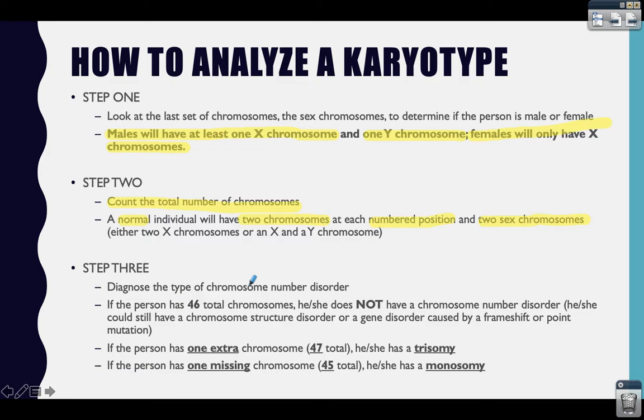The third step is to diagnose whether the person has a chromosome number disorder or not. We are not doing chromosome structure disorders for our class, so we're only looking at total number of chromosomes. Remember, if there are 46, that person does not have a chromosome number disorder. That person may still have a structure disorder or a gene disorder caused by a frameshift or point mutation, but those cannot be diagnosed from looking at a karyotype.